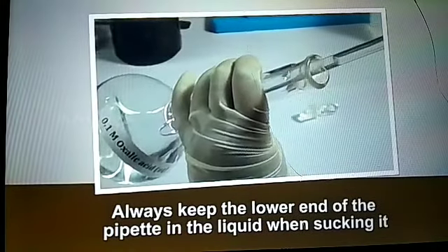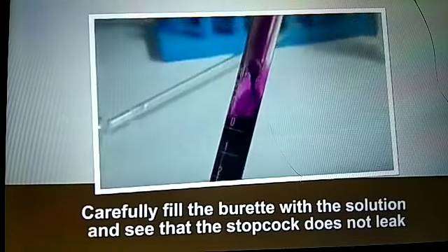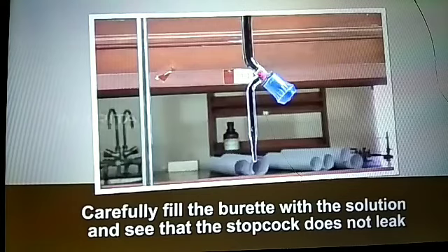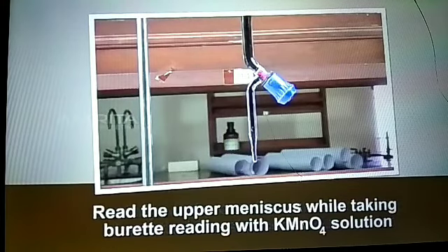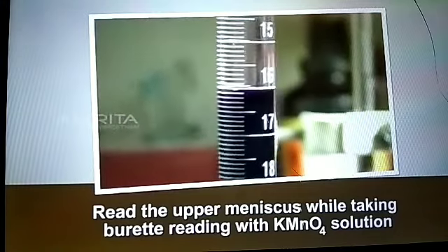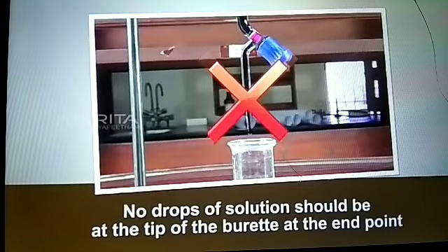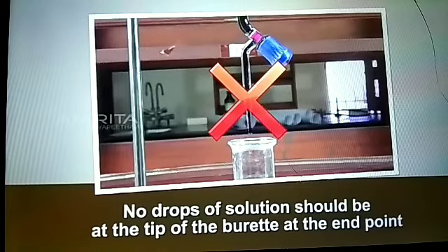Precautions. Always keep the lower end of the pipette in the liquid when sucking it. Carefully fill the burette with the solution and see that the stopcock does not leak. Read the upper meniscus while taking burette reading with potassium permanganate solution. No drops of solution should be at the tip of the burette at the end point.